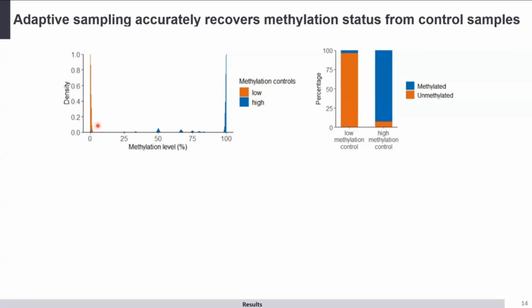Secondly, our analysis revealed that even when only a single read covered the methylation site, the methylation level remains largely unchanged, as you can see in the top right figure here. This consistency supports the reliability of Nanopore technology in methylation detection, even with just a single read. But we acknowledge that the reliability of single-read methylation calls may vary depending on the sample's methylation heterogeneity, and this result primarily focuses on the methylation control samples.